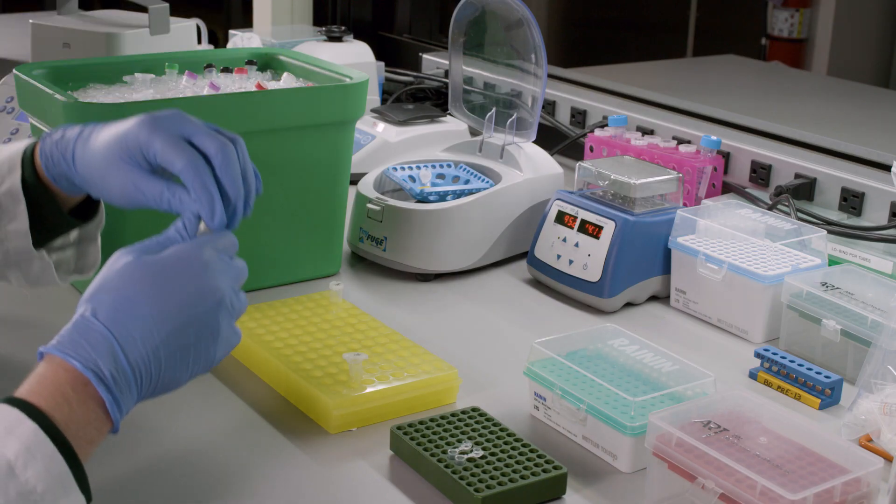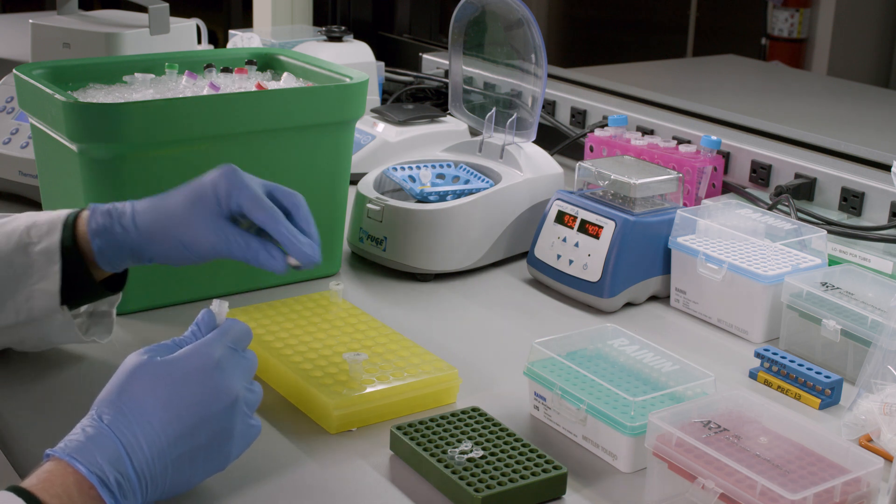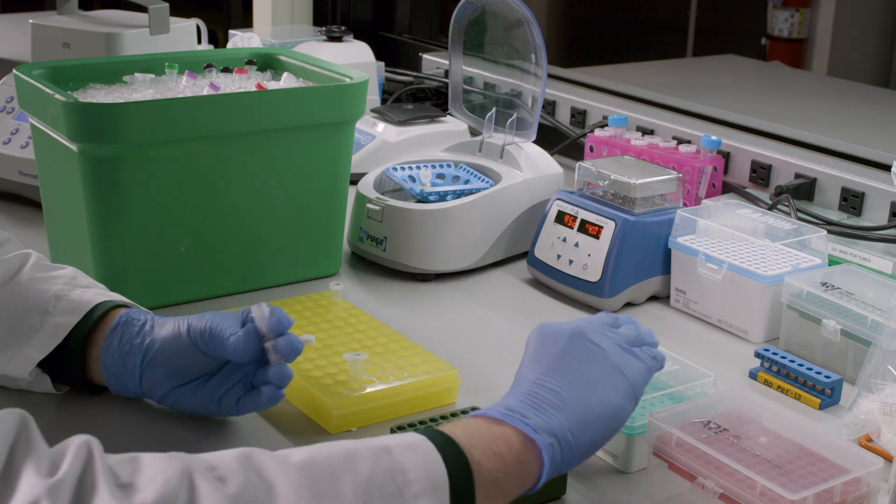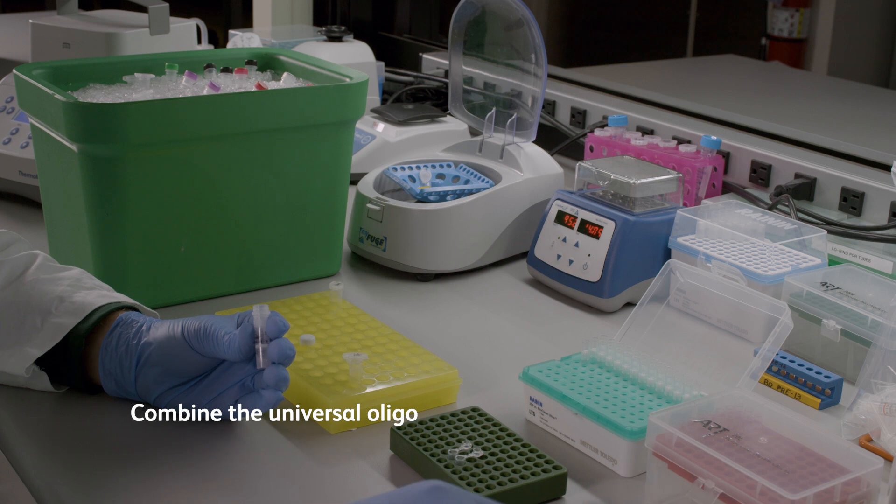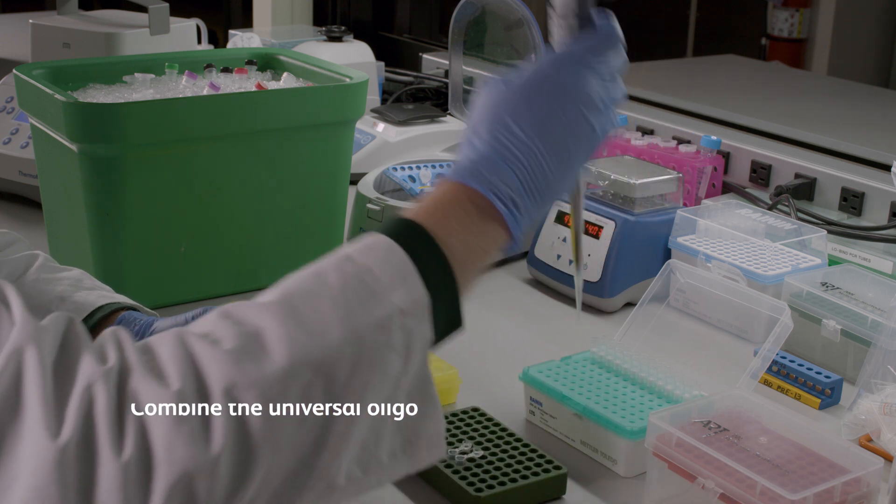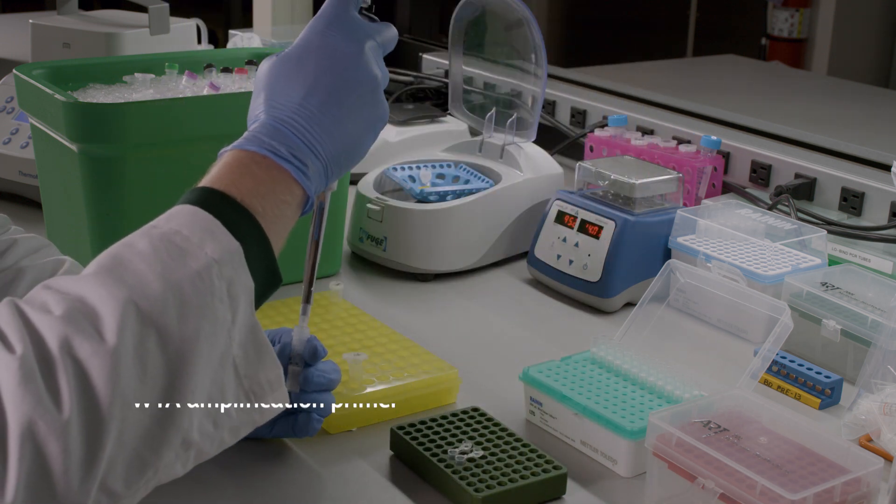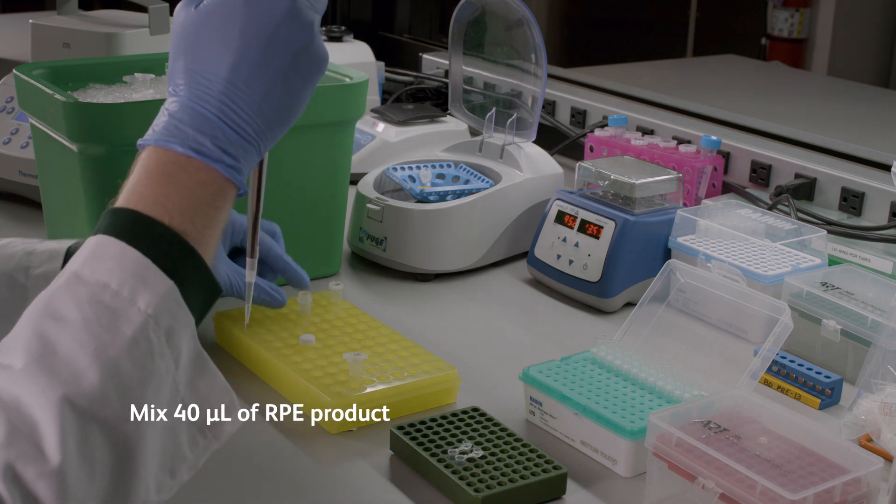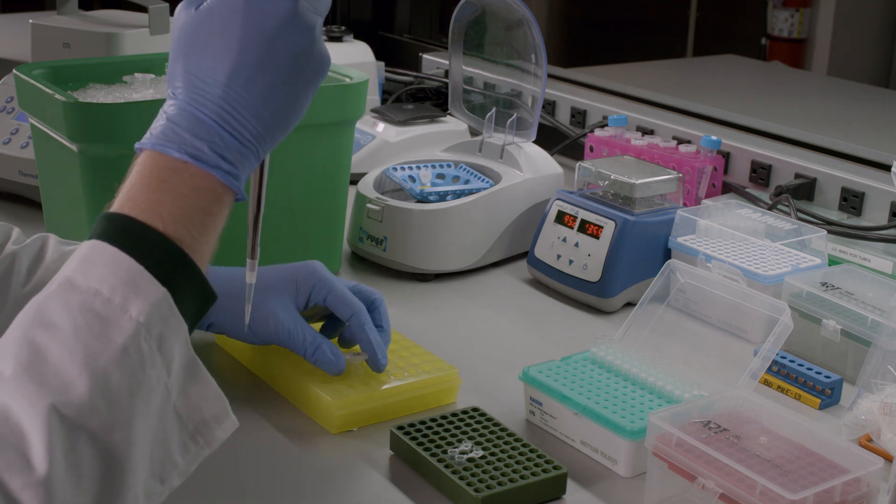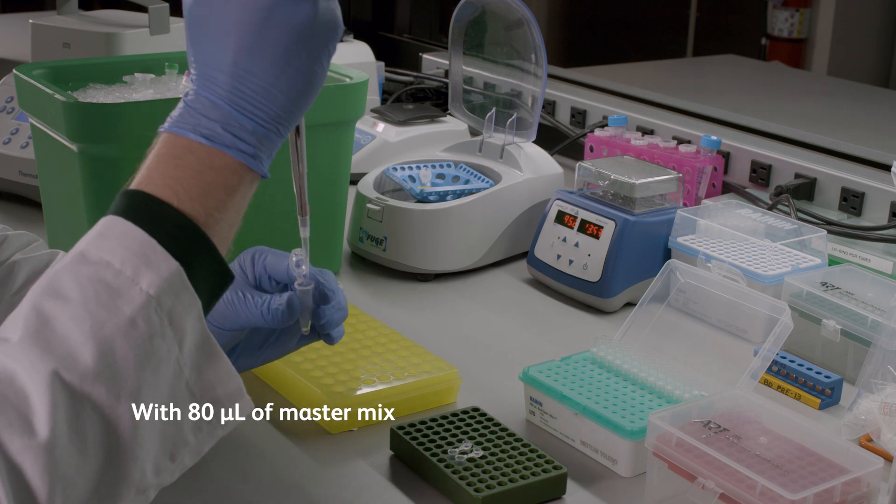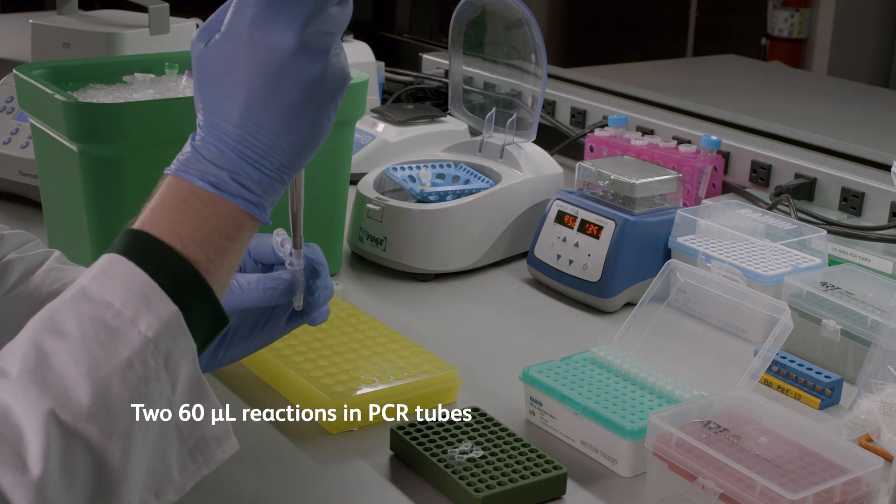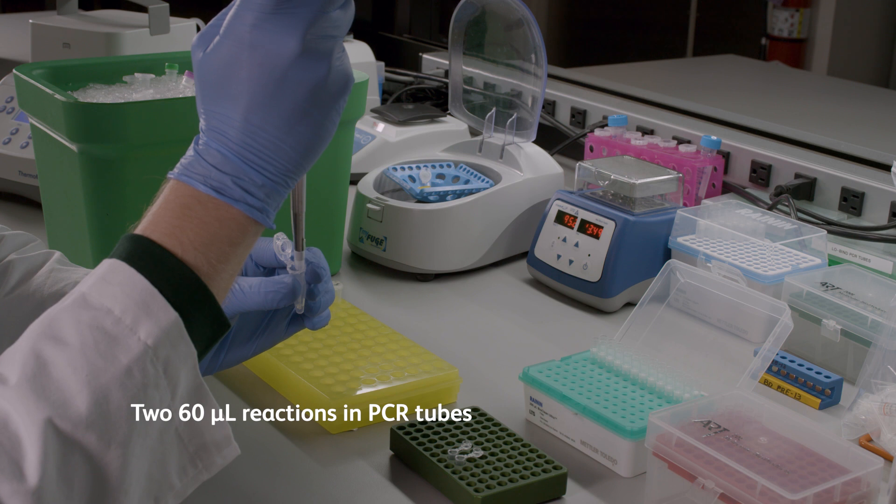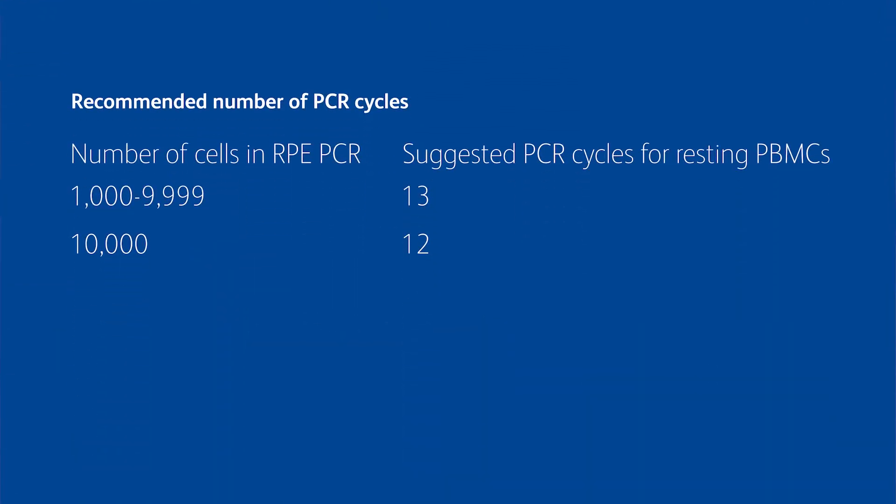After AMPure purification of the combined RPE products, the next step is RPE PCR. Make a master mix by combining the universal oligo, WTA amplification primer, and PCR master mix together. Mix 40 microliters of purified RPE product with 80 microliters of master mix and split into two 60 microliter reactions in PCR tubes. Place the reactions on a thermocycler.